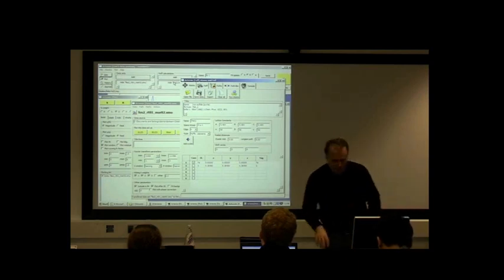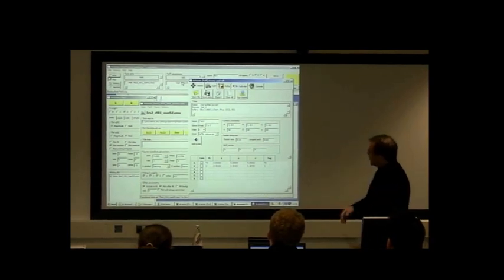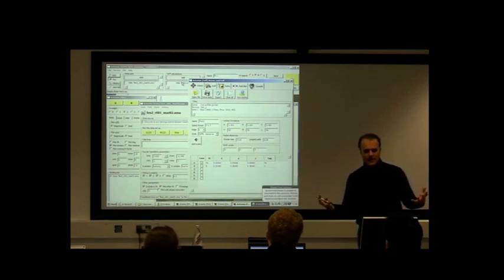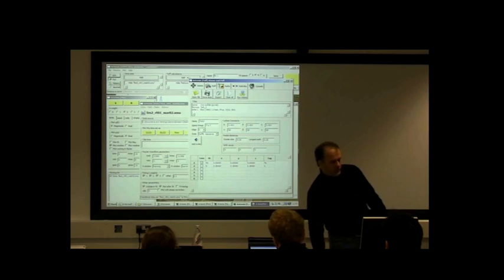So what's about to happen is the software is going to interpret all of this crystallographic data, and it's going to fill up an entire unit cell. It's then going to stack up a bunch of unit cells in all directions to make a big cluster of atoms centered around one of the iron atoms. So again, instead of talking about it, I'll just show you.